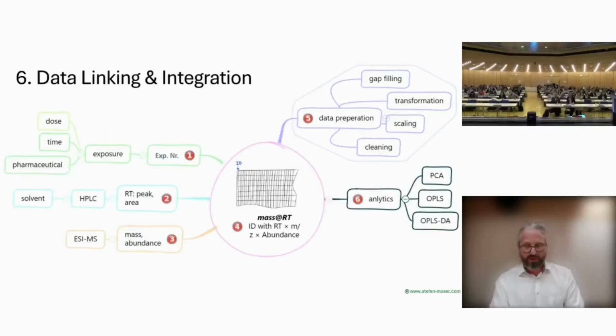After measurement, we have two large datasets, retention time from HPLC and mass value from MS. Often, again, thousands of signals per run. These datasets are processed and exported using the software MS-DIAL, where alignment, gap filling, and redundancy checks for adducts and isotopes ensure consistency. Afterwards, the data will be merged in an Access database from Microsoft or with Python.